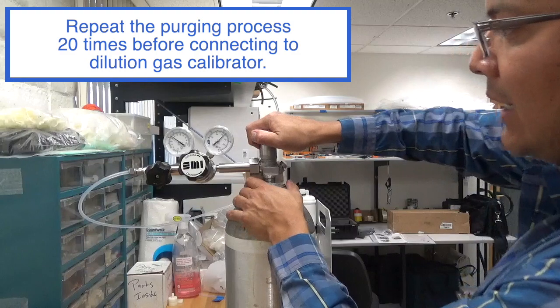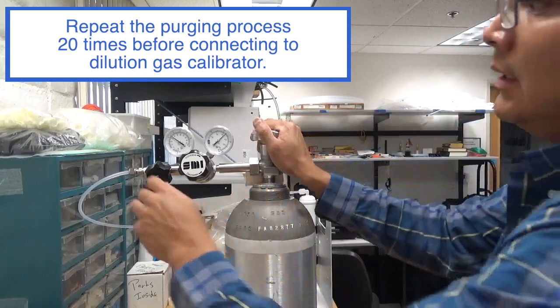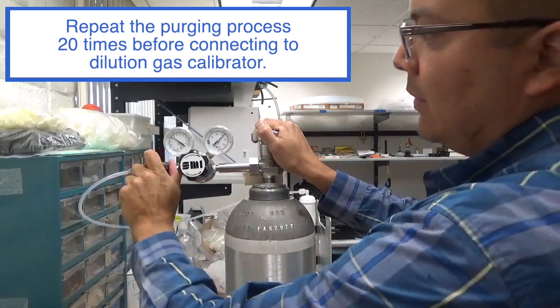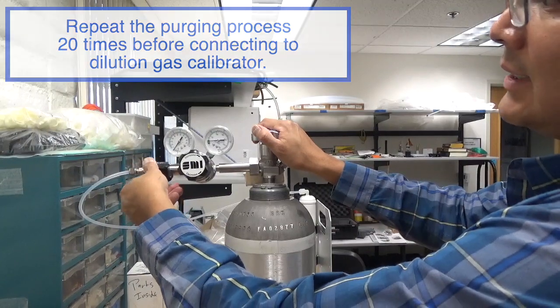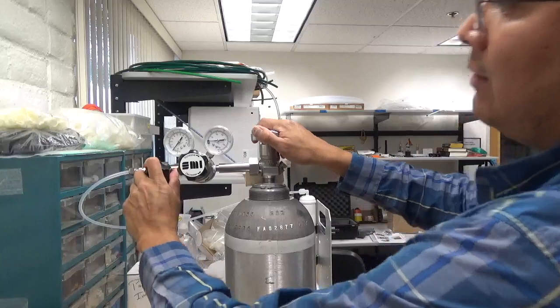So we'll do that again. We'll shoot a little bit of cal gas in. And we'll exit out on the output side. And then we evacuate the gas. Again, we'll shut off the output regulator valve.